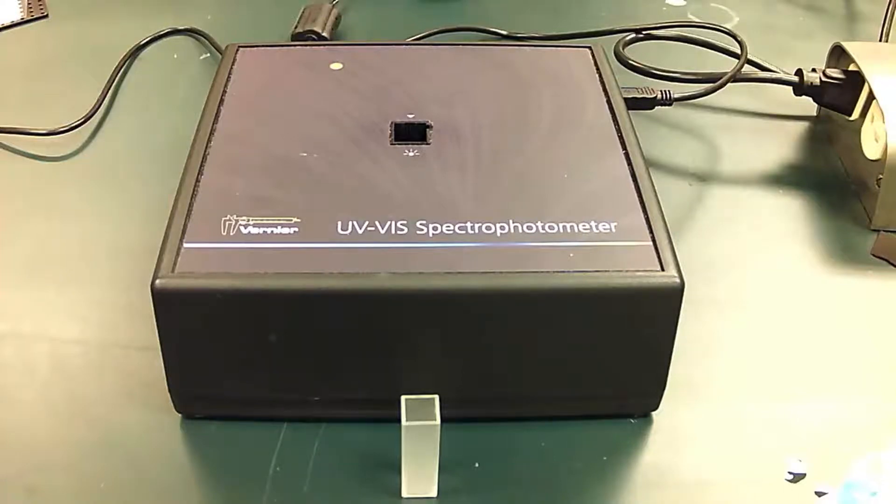Hello, Mark Lingwood from St. Mary's again, and today we're going to talk about UV-Vis spectroscopy. What you're looking at is a UV-Vis spectrophotometer, or we just call it a spectrometer usually. This instrument can look at the absorbance of a solution at all kinds of different wavelengths in the ultraviolet and visible range, and it can tell you at what wavelength the solution absorbs light and how much, which is useful for both identifying compounds and really useful for quantifying how much of a compound there is.